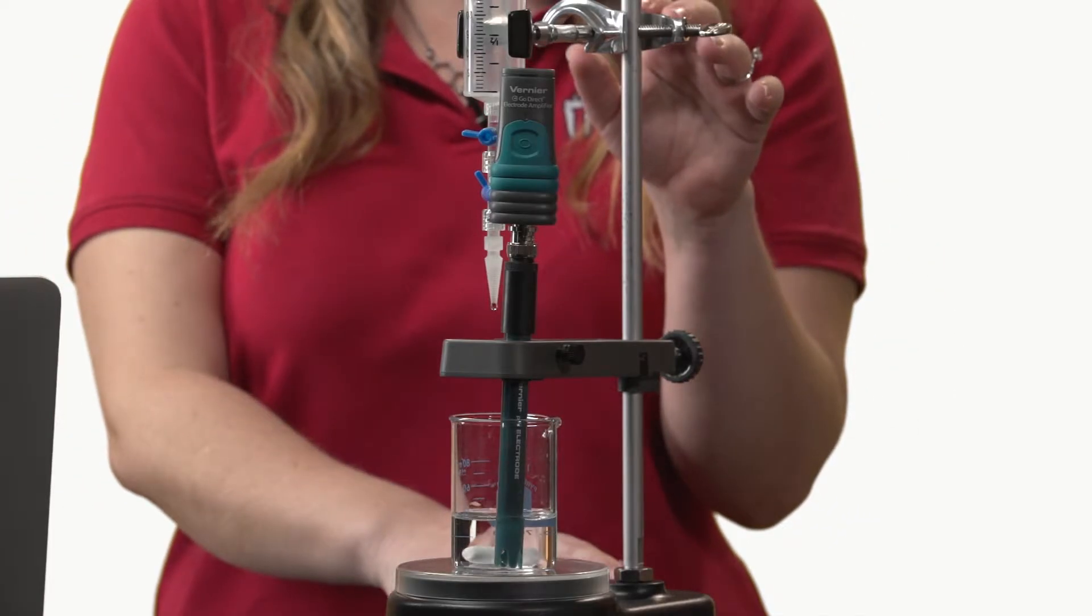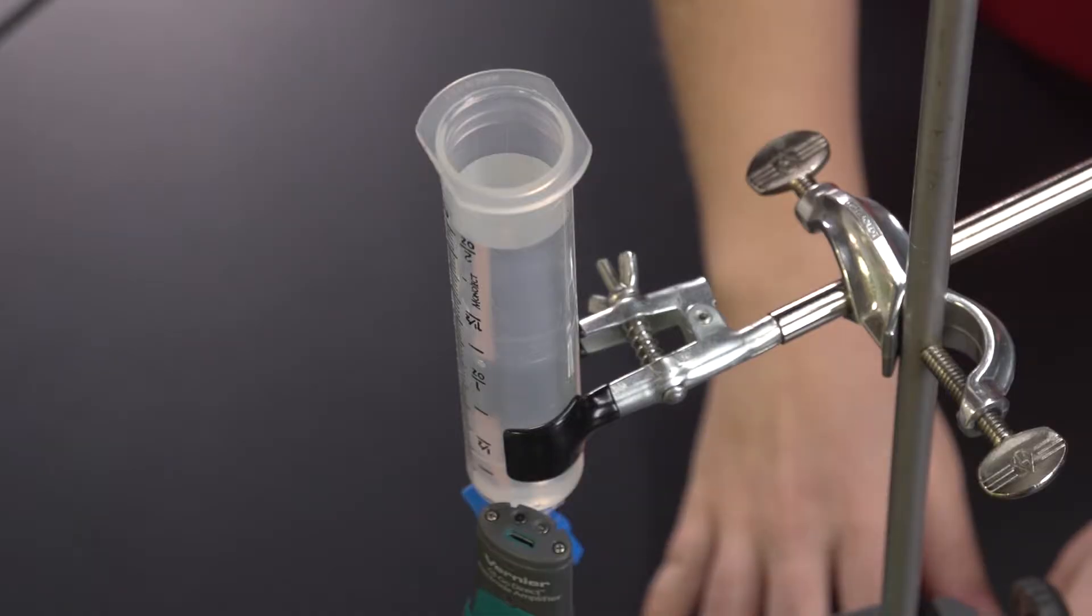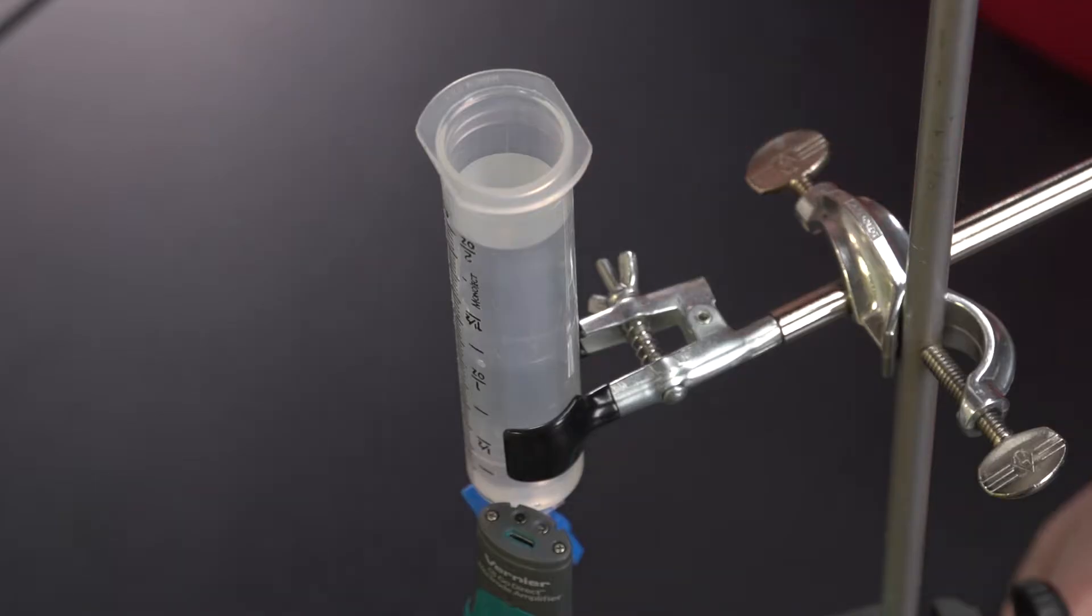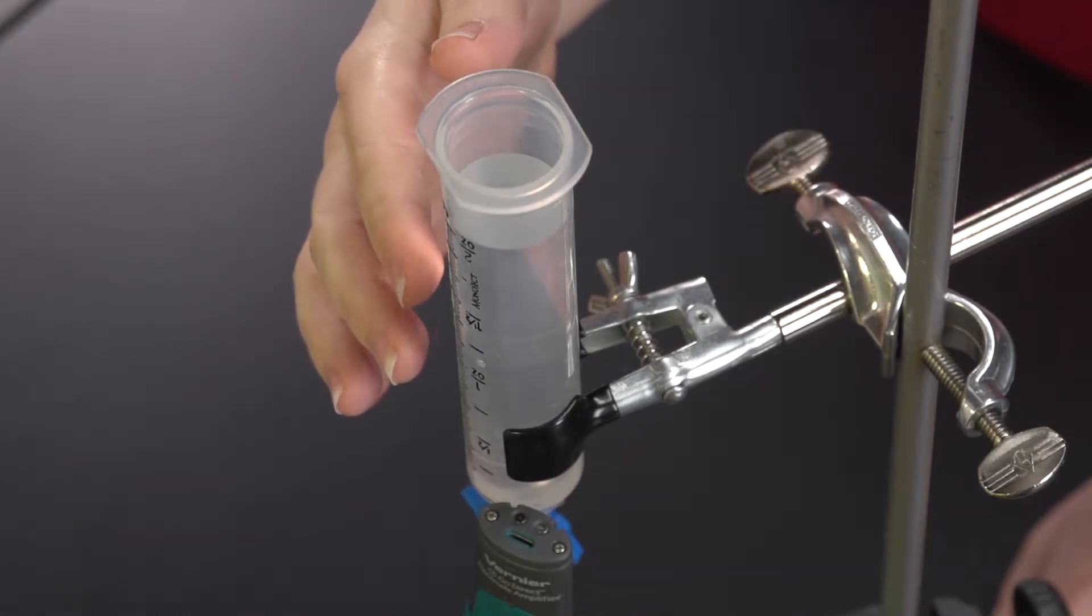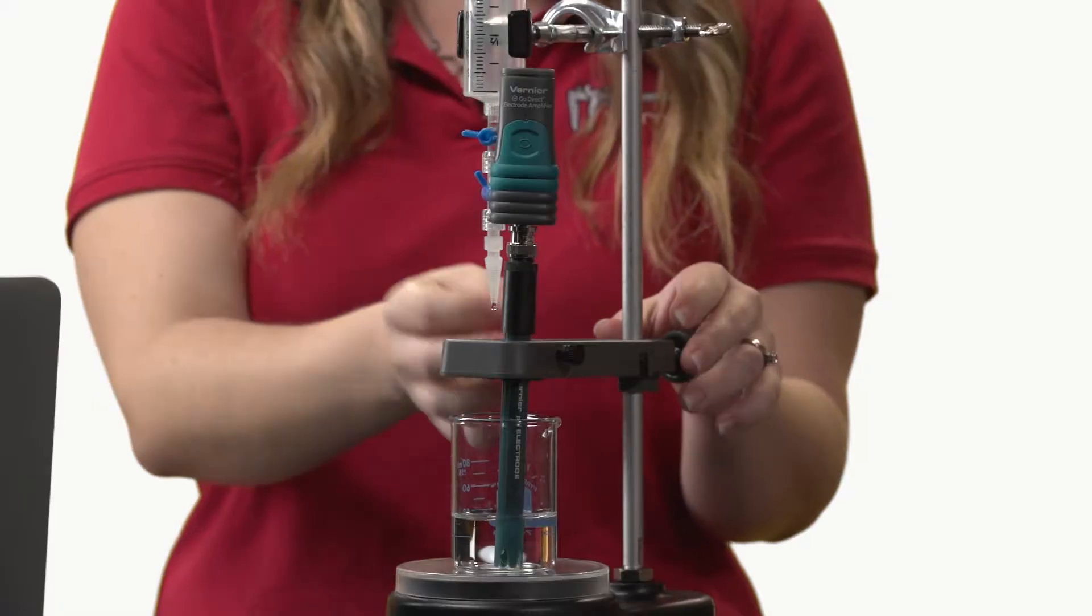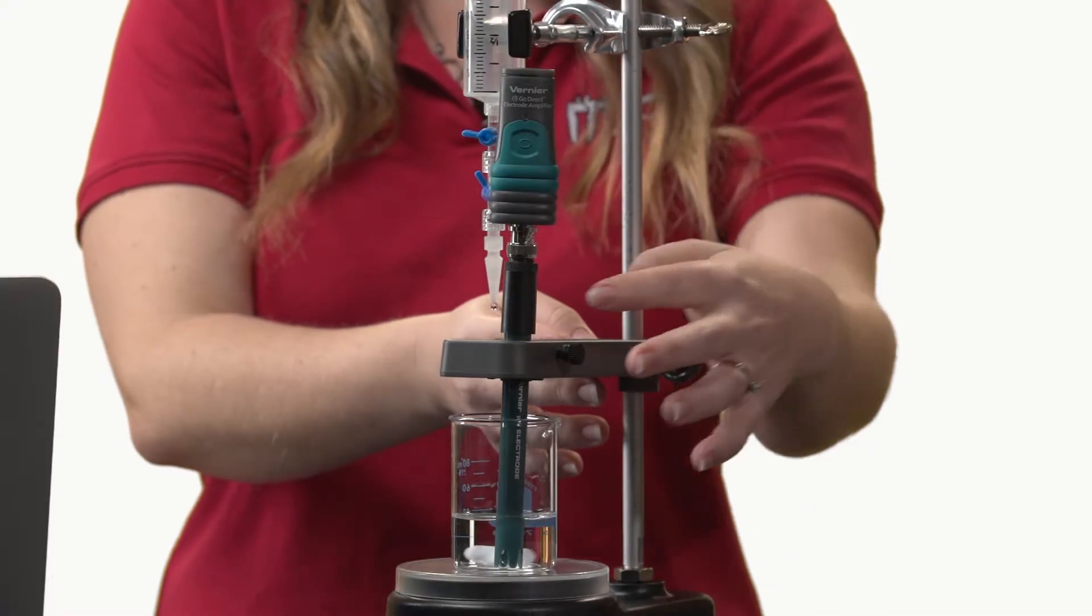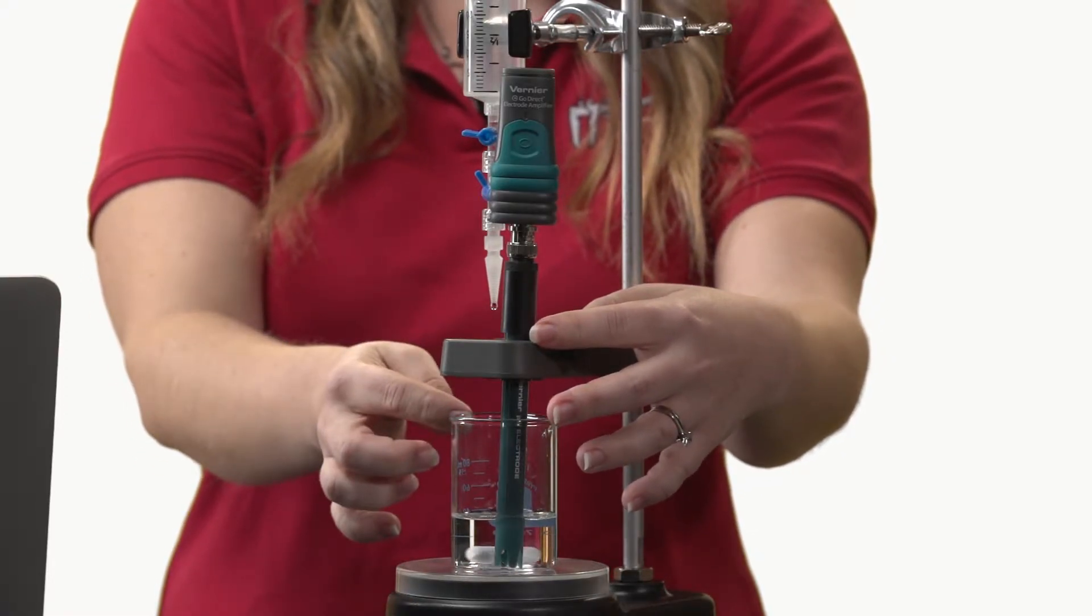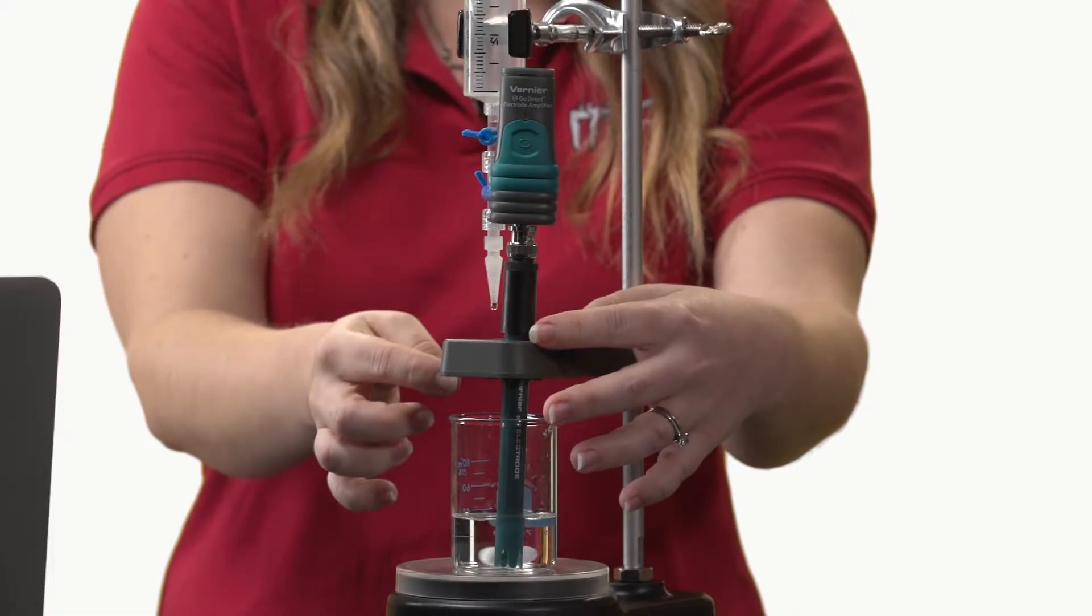I have my stir station with the utility clamp holding my reagent reservoir for the drop counter. Sodium hydroxide is in the reagent reservoir. The drop counter is attached, the pH probe is in the electrode opening, and the drops from the reagent reservoir go through this opening.